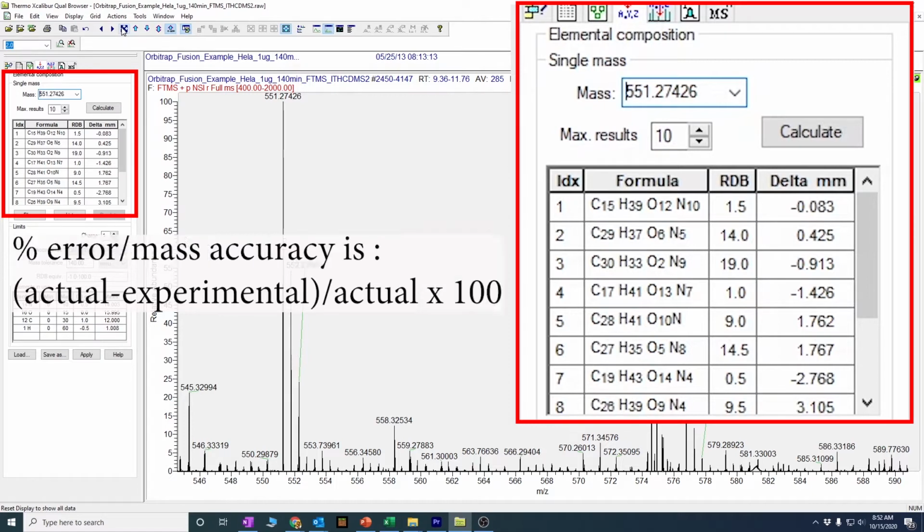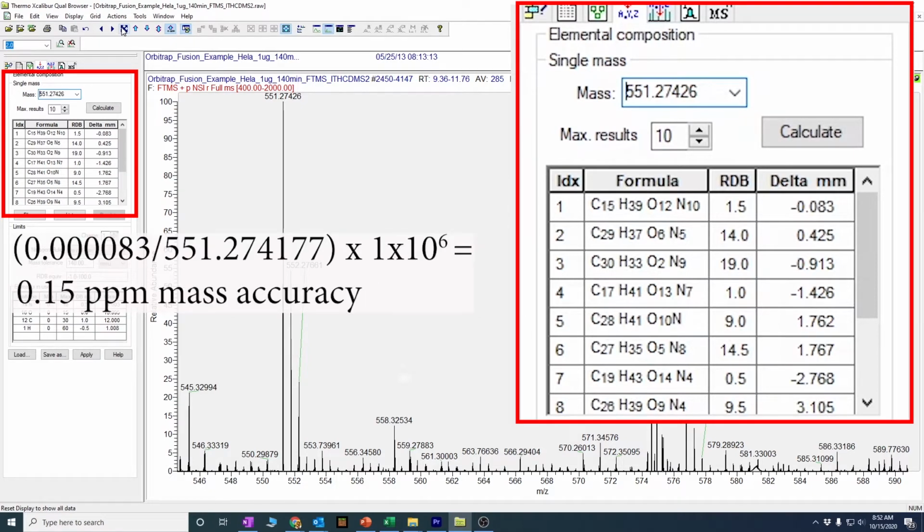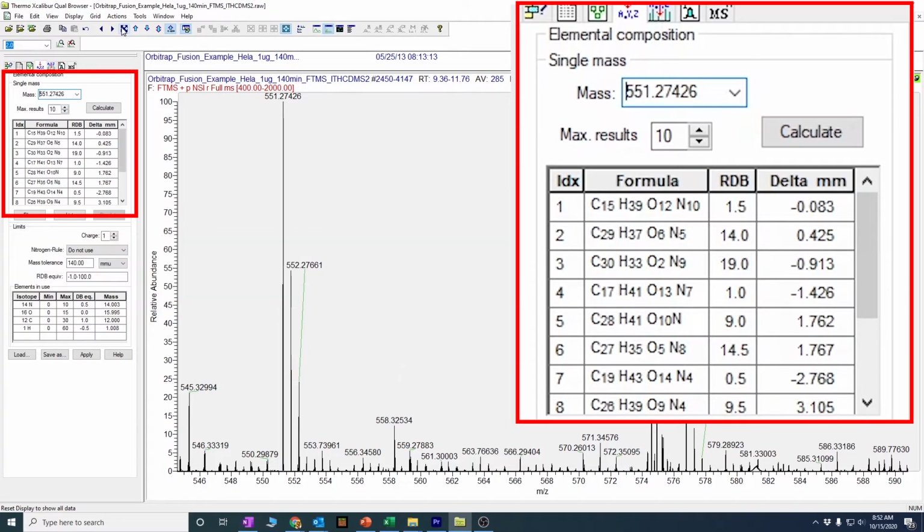And usually what they're going to do when they want good mass accuracy is, a lot of instruments now have two electrospray sources essentially, or two nebulizers for the electrospray source, two things that make aerosols. One sprays the sample and the other one sprays an internal calibrant. So every time you run a spectrum, you have a peak in there whose mass you know exactly, and that helps you calibrate your mass to get good mass accuracy. But you have to have the resolution, you have to have good mass calibration, and then you can get exact mass measurements, which will give you the chemical formula.